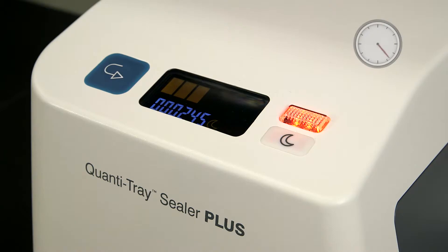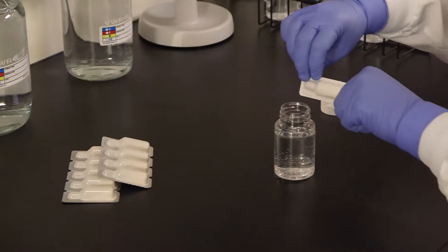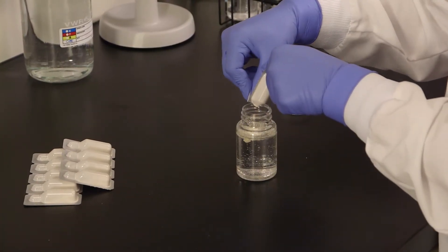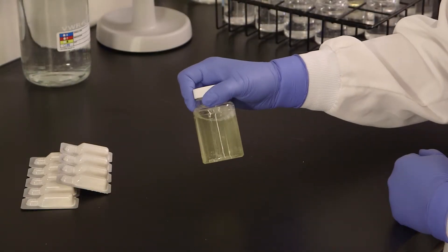Turn on the sealer and then wait until a green bar appears on the display. The sealer has now reached the appropriate sealing temperature. Add the Entralert powder to a 100 milliliter sample and cap the vessel. This time, shake until the reagent dissolves completely.